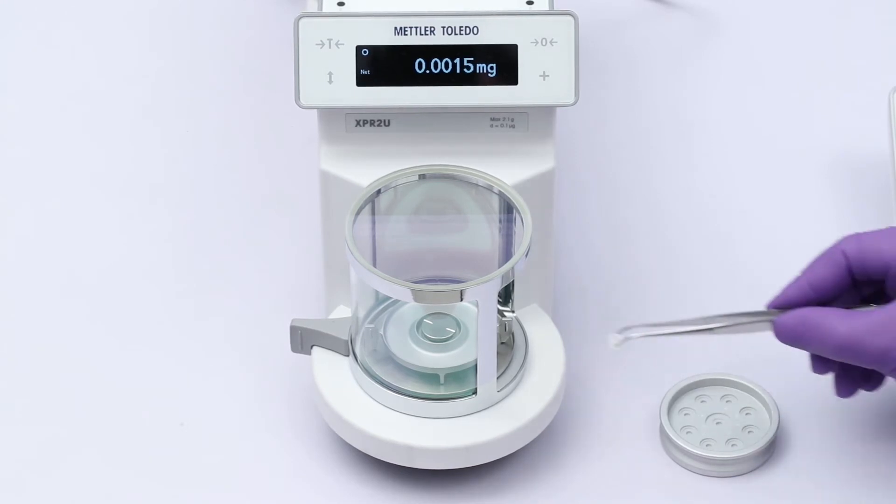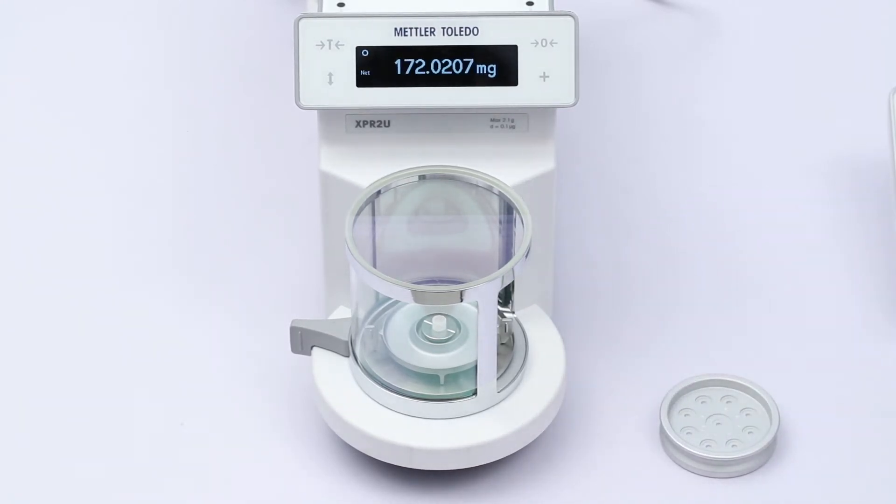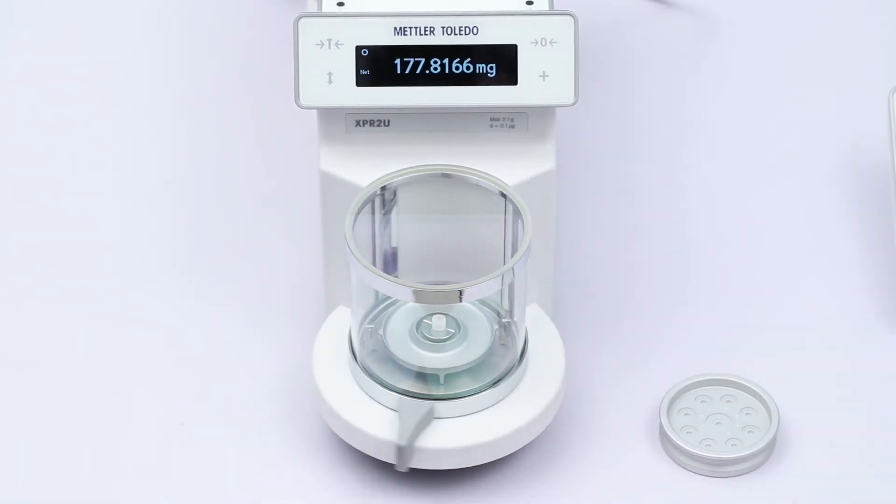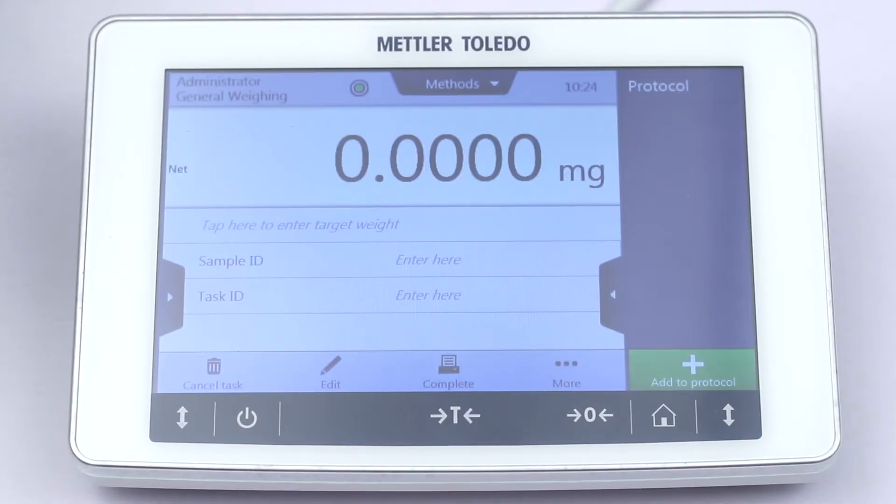Place an empty 70 µL alumina oxide crucible on the external balance and press the TARE key.